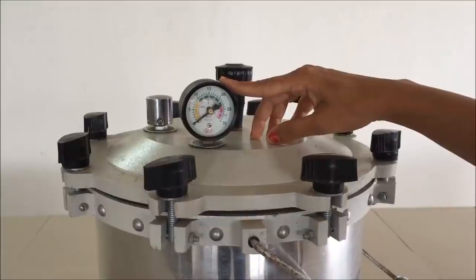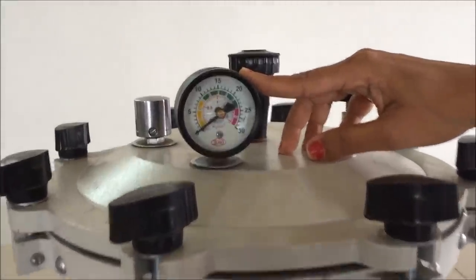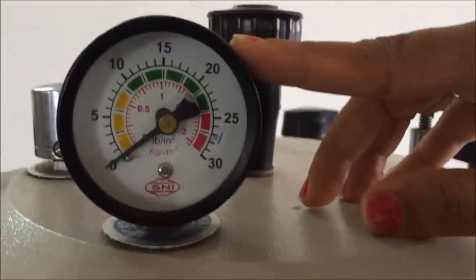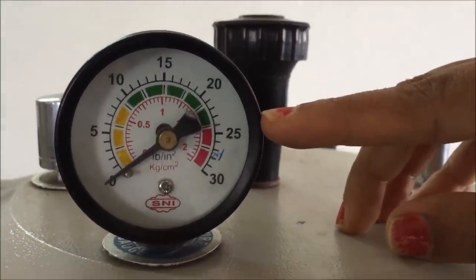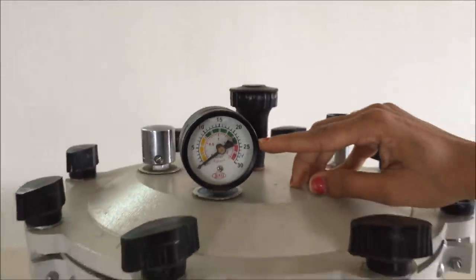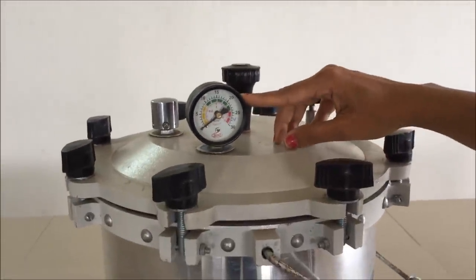It is having different units like this pressure valve which indicates the pressure which has been created inside the autoclave. Pressure plays an important role for the sterilization point of view because the main principle or efficacy behind autoclave is pressure only.